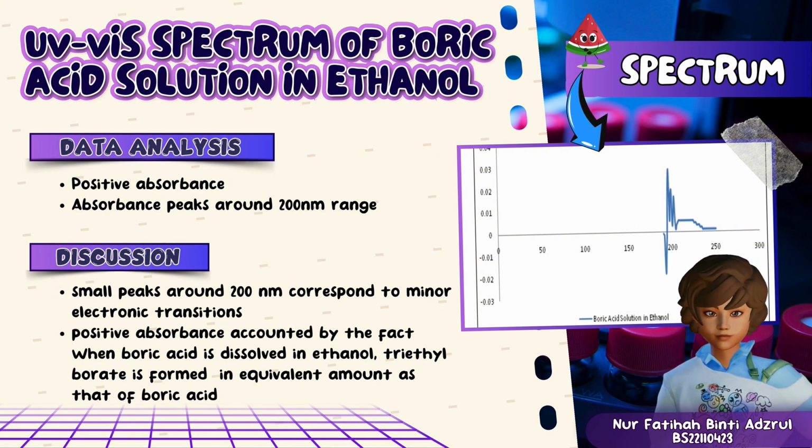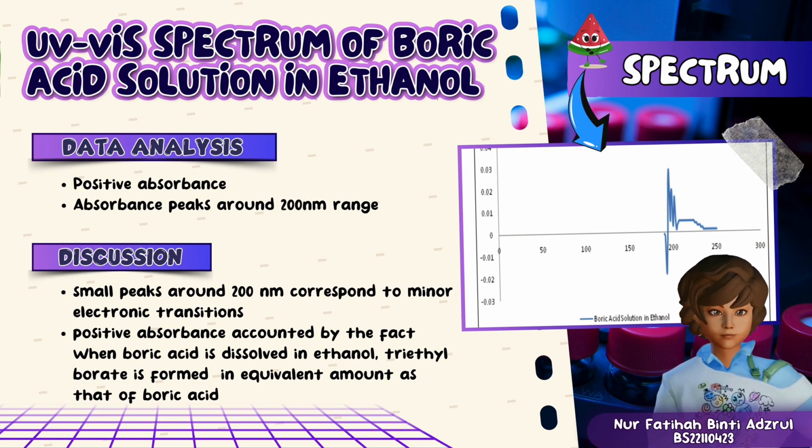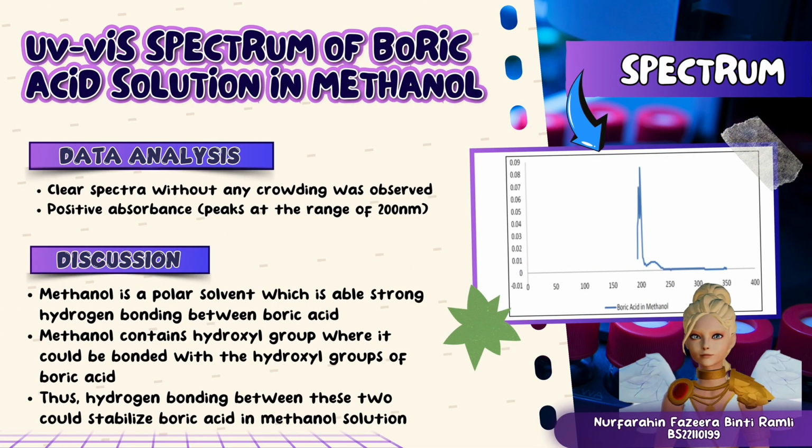Hexane is a nonpolar solvent, while boric acid is polar and requires a polar solvent to dissolve. As a result, boric acid is insoluble in hexane. Other solvents like THF and glacial acetic acid are polar but not as effective as water, methanol, or ethanol.